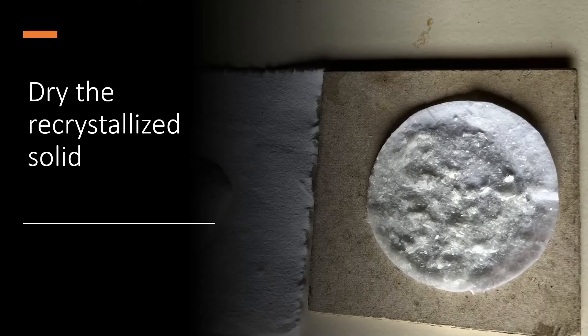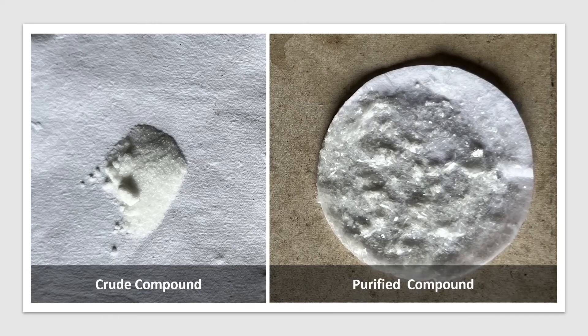The next step is to dry the purified solid. Here you can see your crude compound and your purified compound. After purification, we get large shiny crystals of the compound. This compound is now free from soluble and insoluble impurities.